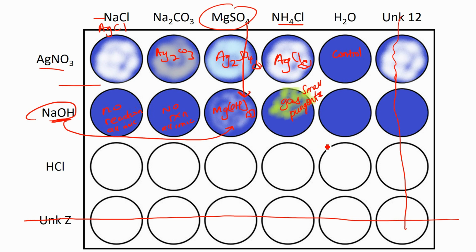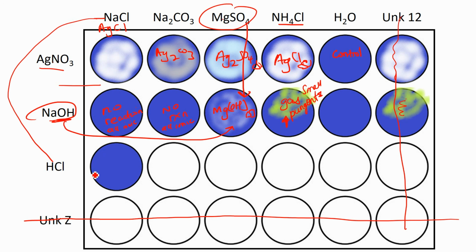That's this gas. The ammonia gas is not green. We are just using green here so that you can know that there's a gas coming out, but it's not green. Ammonia gas is colorless and makes you cry. So don't worry about the unknown. Again, react HCl with sodium chloride. I don't expect any reaction here because all are ionic.